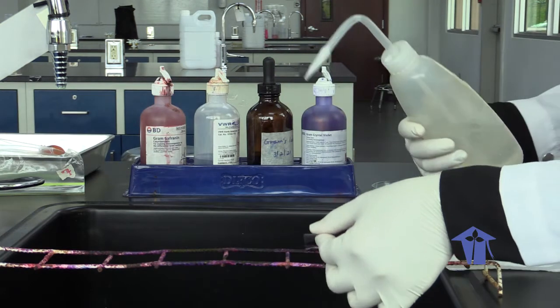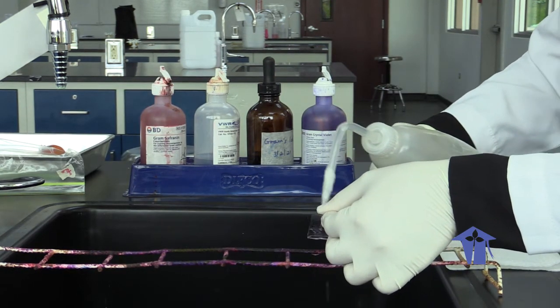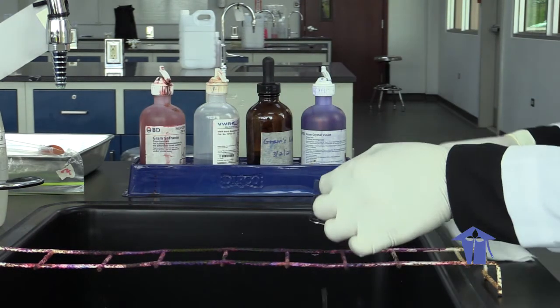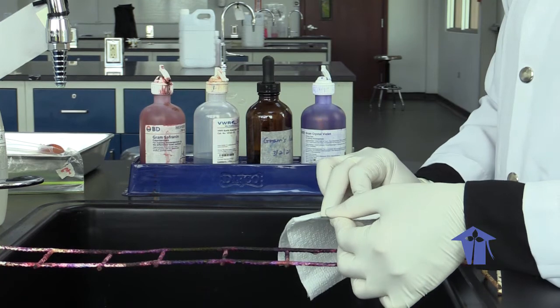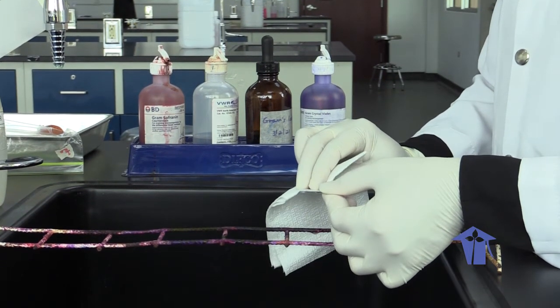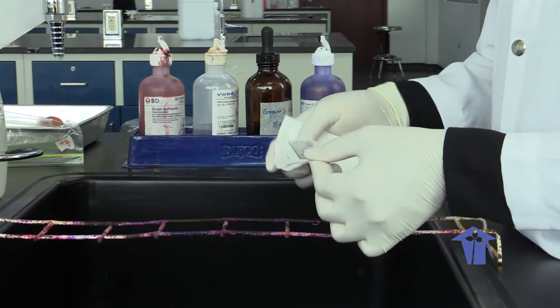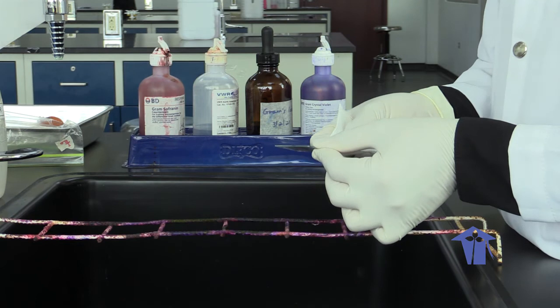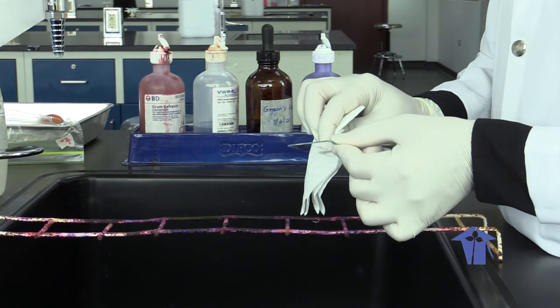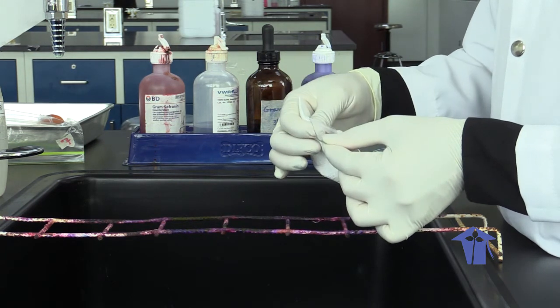Finally, we wash out our safranin. Again, hold at an angle so it can wash off. And then we blot dry. Now we are not blotting the region where your sample is present, you are blotting around it. Your tissue will pull up the water from those regions of your slide. You want to make sure you get rid of any excess water because that is going to affect how you can see your sample under your microscope.